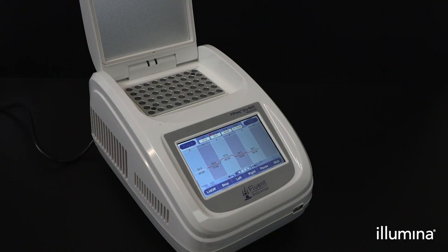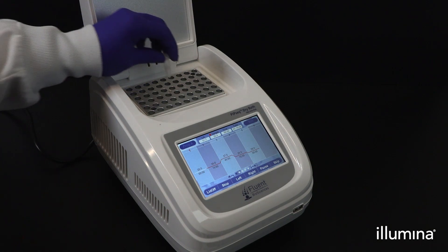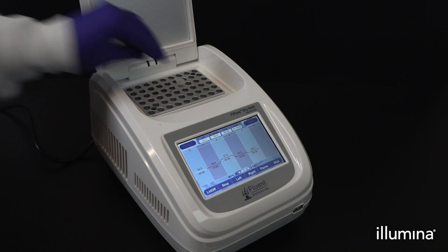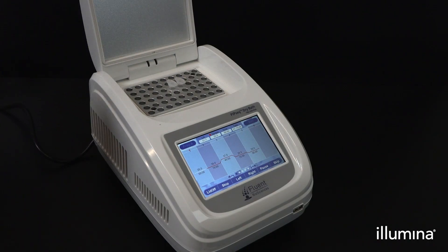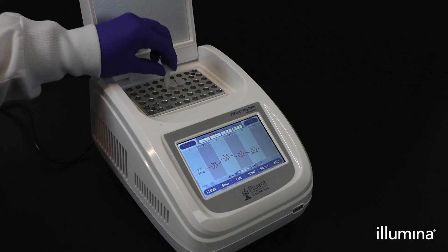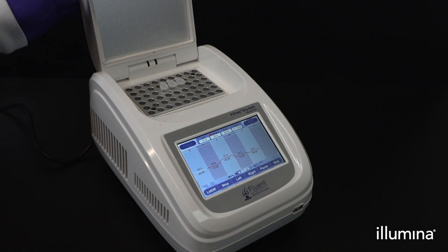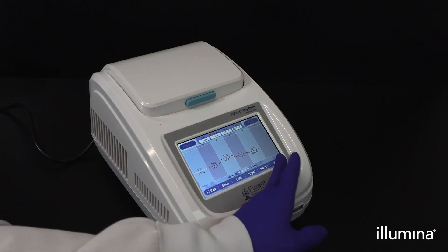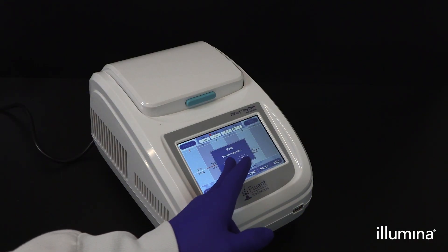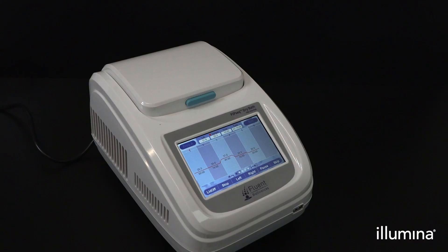Verify that the pip-seq dry bath is preheated to the appropriate temperature for your sample type. Then insert the samples into the dry bath and select skip and yes to begin the lysis incubation. Please refer to the user guide for the cell and nuclei lysis temperature profiles for this step. After incubation is complete, this is the first stopping step of the workflow. Samples are stable at 20 degrees Celsius for up to 96 hours.